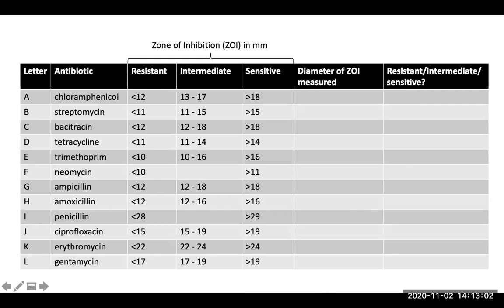So once you've filled out these last two columns in the table, then you'll answer the questions that are on the assignment page and submit them on Canvas. Hopefully in your study, you'll find at least one antibiotic that seems promising to try for treating Marisa's urinary tract infection.